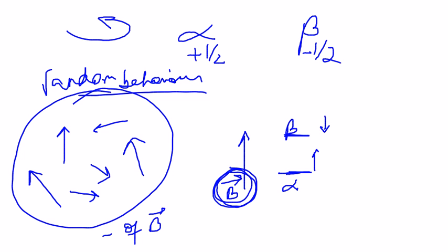And so you have to basically couple this with a radio frequency such that the two states resonate with each other. That means when the external field is 0, the two spin states will have the same energy, but as the field increases, the difference between the two states also is going to increase.